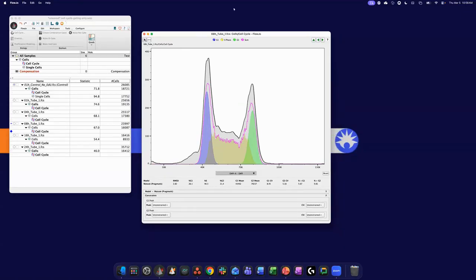All right, I think I see something in the chat. Let me take a peek. What is a suggested CV value to make sure the data is good? And if my cell cycle distribution is not what the literature shows, is it okay? Edited cells have similar wild type. When do I do experiments? So this means my edited cells do not affect. Let's see, I might have to reread that. So I'll take it one at a time.